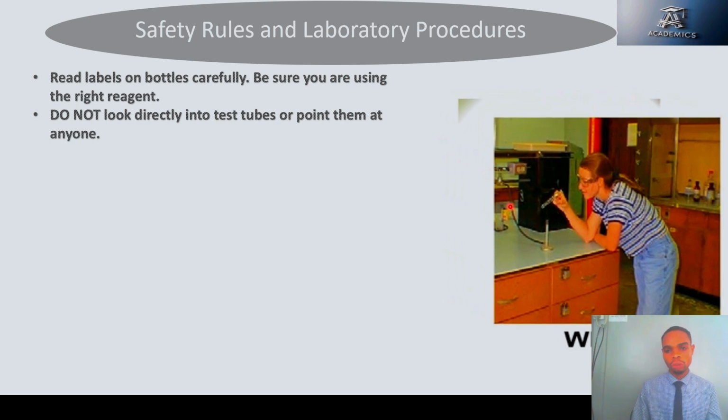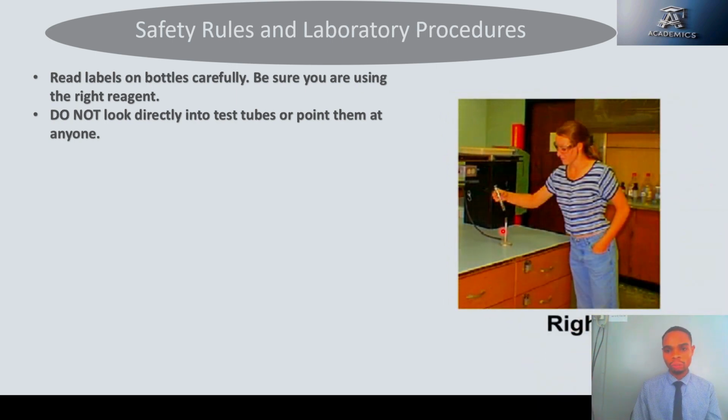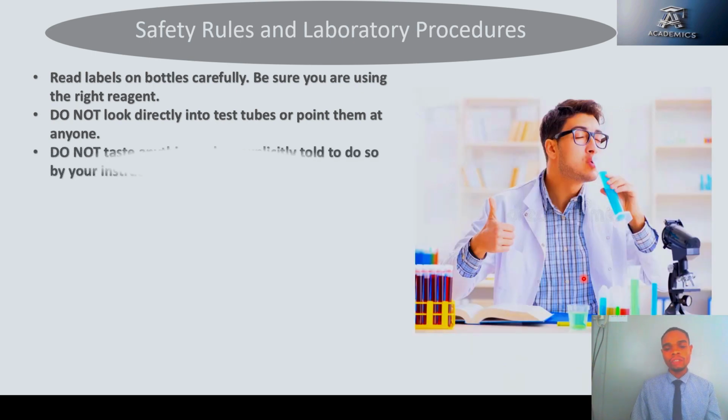Make sure you do it this way. You face it away from you. This is the best way to do it. And if you're working with a partner, do not face it towards the partner, but face it away from both of you.